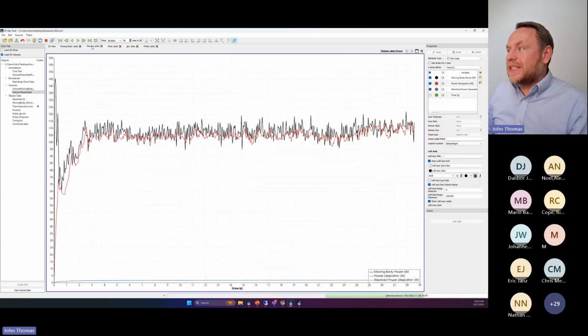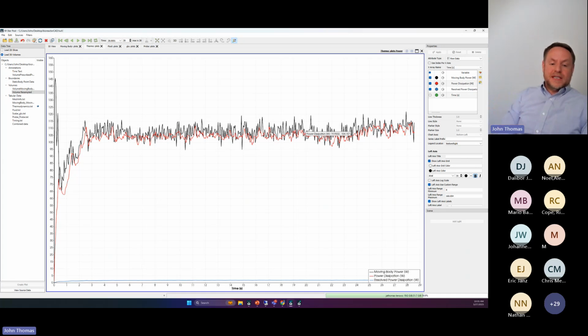And also the fact that we're satisfying the first law. I keep saying the second law, I don't know why. The first law tells us that we're resolving all the way down to the Taylor scale and beyond, such that the LES filter is just mopping up the subgrid stuff as it was designed to do. If your filter is too big in an LES simulation, such that your resolution is above the Taylor scale, that's when this starts to break down, because you're asking the subgrid filter to mop up eddies with structure, with shape, as it were, some anisotropic eddies.